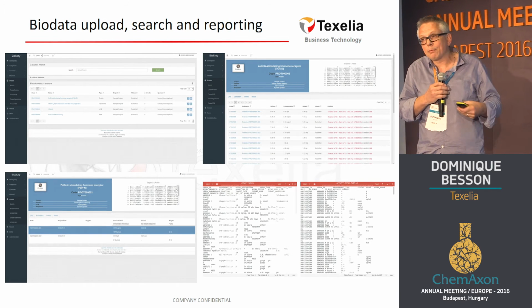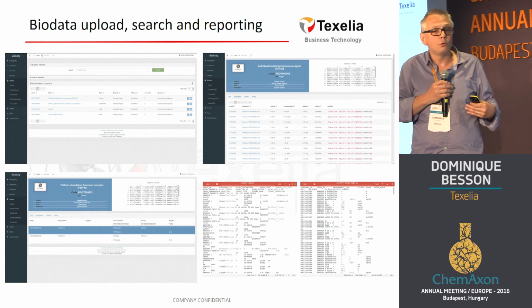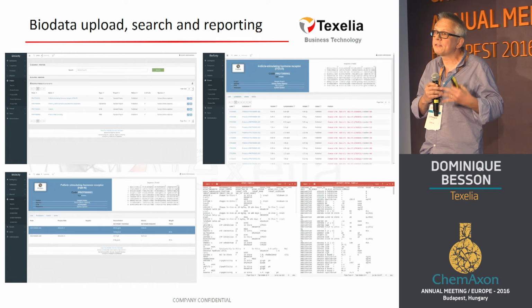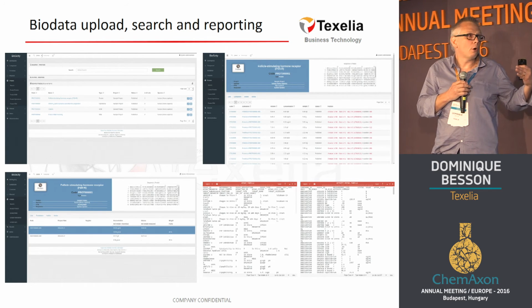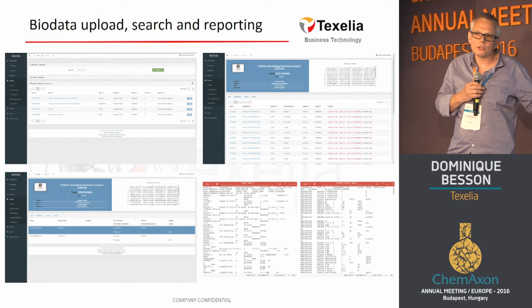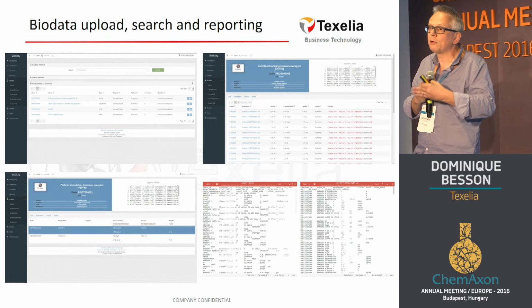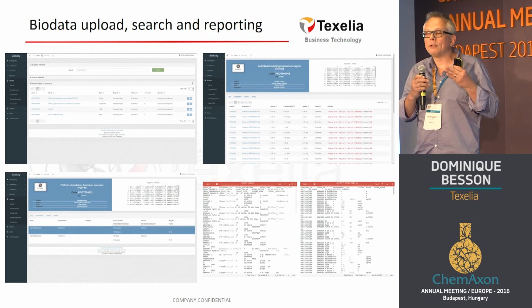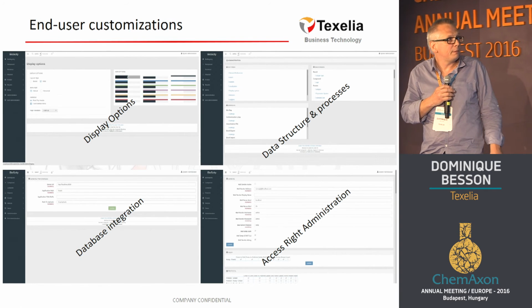After that scientific step that is done with ChemAxon, then you move back to BioScity, and then you have a very standard workflow for lab people, where you are registering biodata, you are able to search for information inside, you are able to report information to the different end users in the format you like to have. So this mix between the two pieces of software is quite interesting.